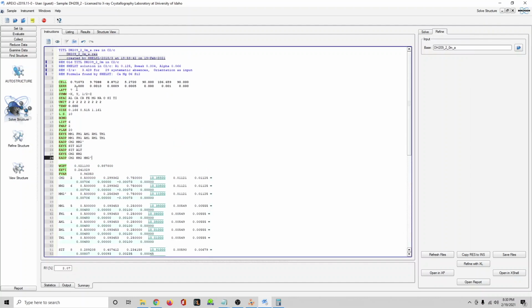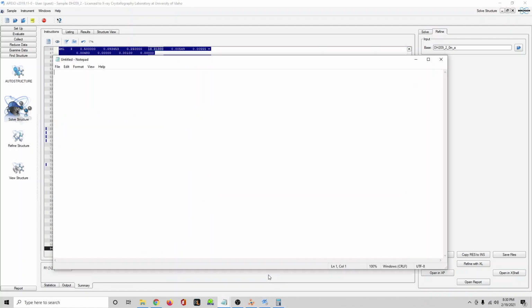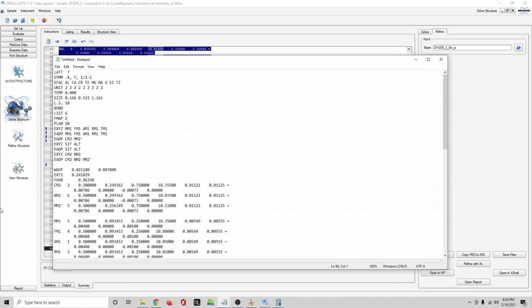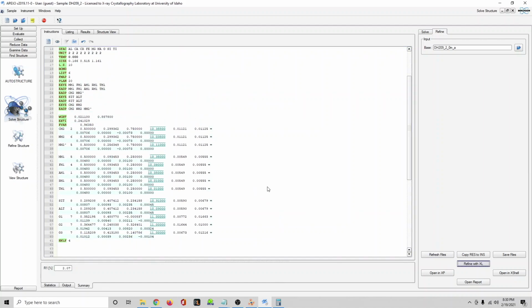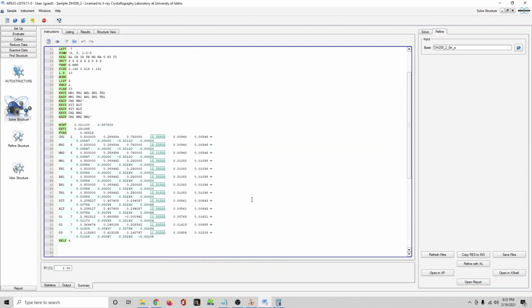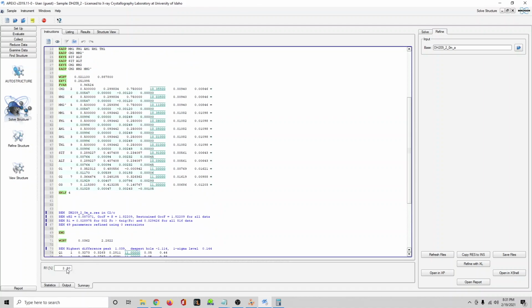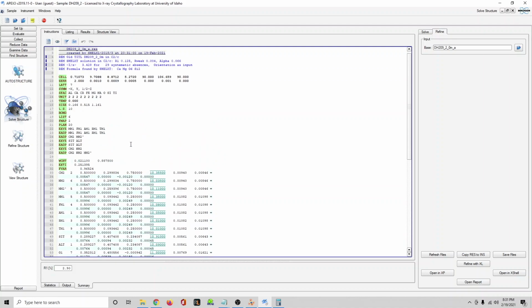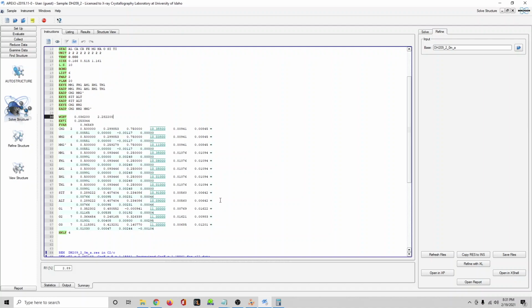Okay, now let's save all that so I don't have to do anything if I really messed it up. And I think that's all correct, so I'm going to click refine. All right, it didn't totally explode at least. And this, again, since we're not refining any parameters, the R did go up by a bit, by 0.8%, it looks like, which isn't a huge deal, because if you absolutely knew that this particular crystal had those constituents, this is absolutely the correct way of doing things.